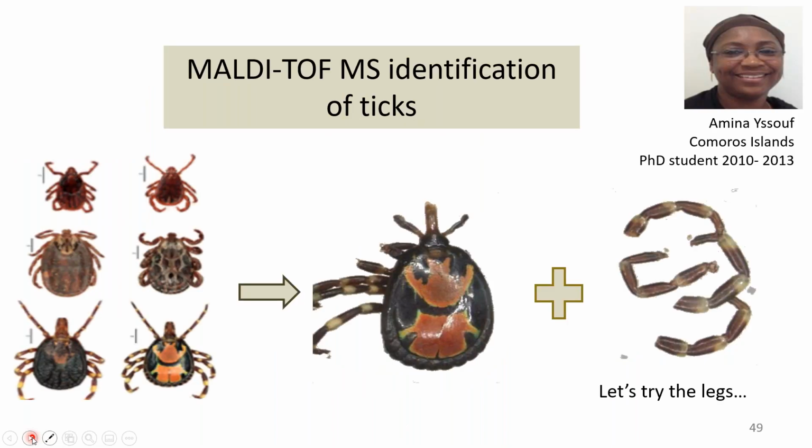So we decided to start with ticks a while ago with Amina, and we had all those ticks on the left in our insectary, and we decided to try on legs.